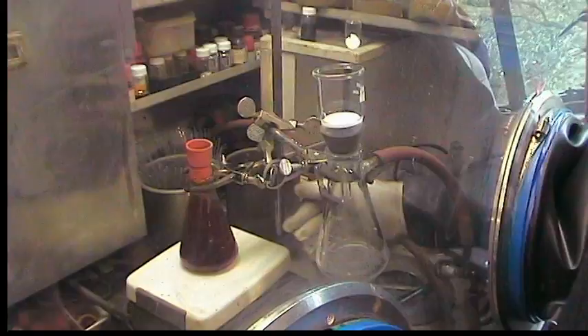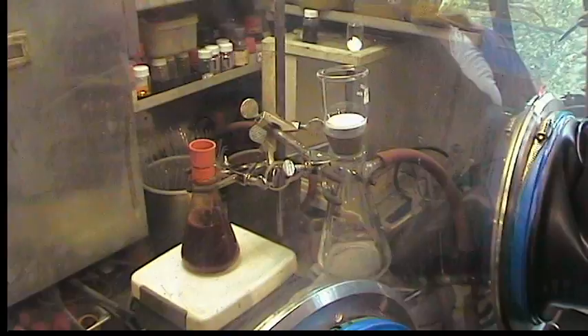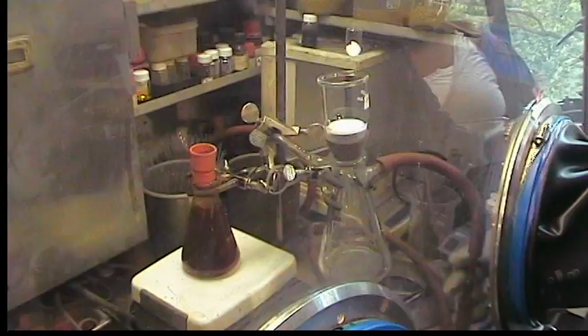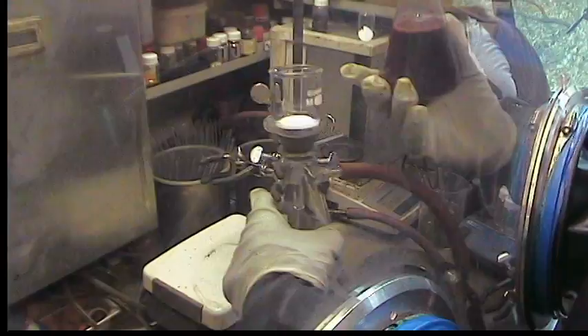The second reduction of the molybdenum 4 to the molybdenum 3. And what we can do is stop the stirring — actually it's better to keep it on for now. We're going to filter the purple solution away from the precipitate.